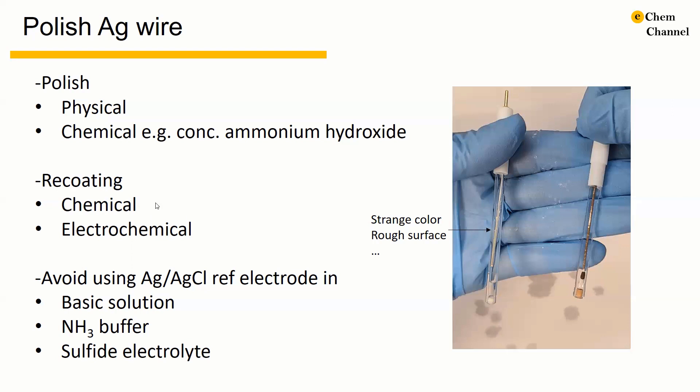For the chemical method, you can buy reagents that help you re-coat the silver surface. For the electrochemical method, we put the freshly polished silver wire back into potassium chloride electrolyte, then make a two-electrode cell with the reference electrode as the positive electrode and the platinum electrode as the negative electrode. We apply a very small current, such as 10 µA, overnight. This will produce the silver chloride coating on the silver wire.